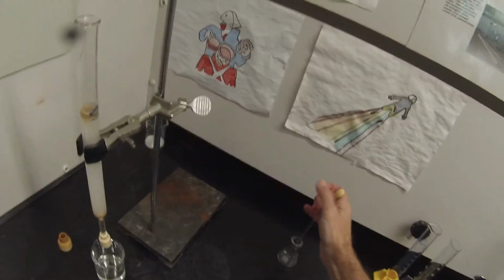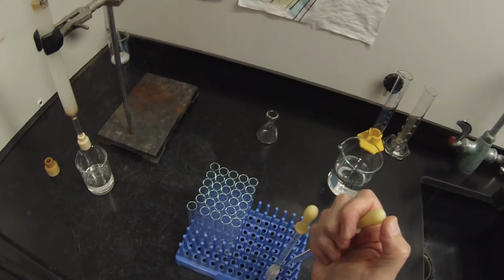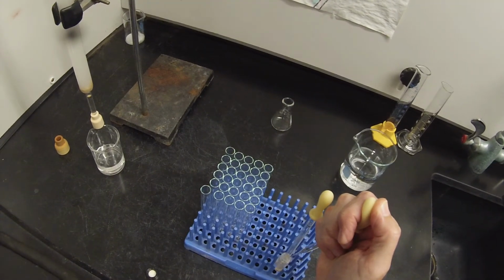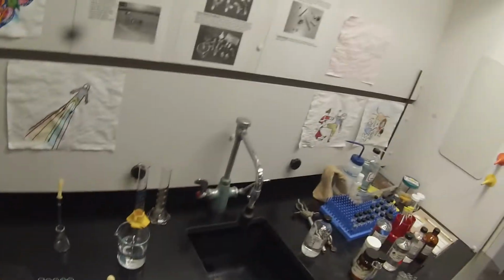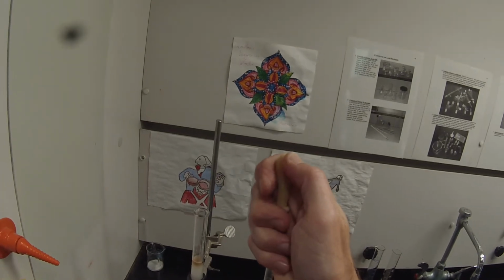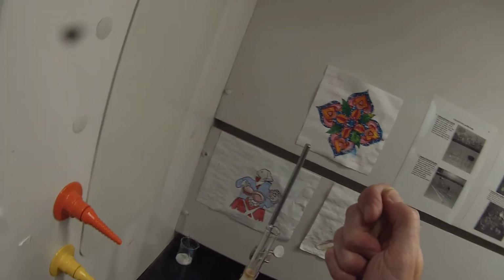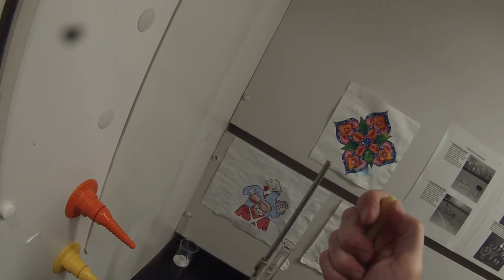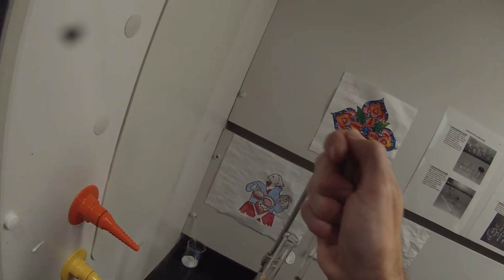So it looks like I'll need to add more ether to get it to dissolve. This is always the problem you fight, is that it won't go into the nonpolar component of the mixture. So you end up having to add it in the polar component of the mixture. And as I said, when you have too much of the polar component of the mixture, then it doesn't separate. It would be ideal if this stuff would have been willing to dissolve in petroleum ether. I knew it wouldn't dissolve in petroleum ether. I was kind of hoping it would dissolve in that 1:2 mixture, but no such luck.